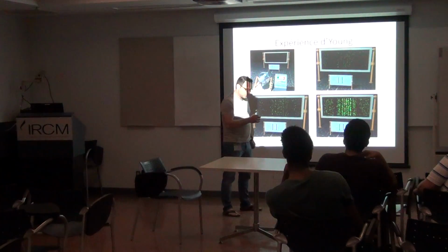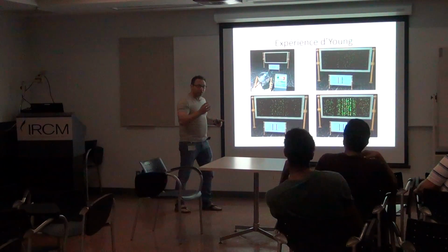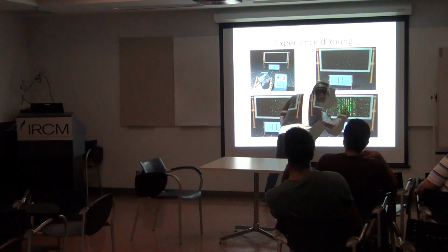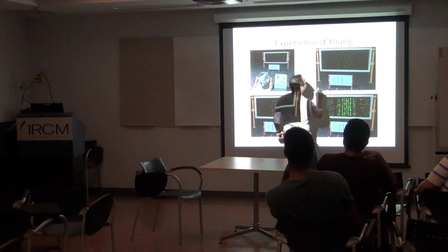And since it's going into an objective, it produces a diffraction pattern also. While I'm getting more photons, it's going to be much easier to figure out where the center is.